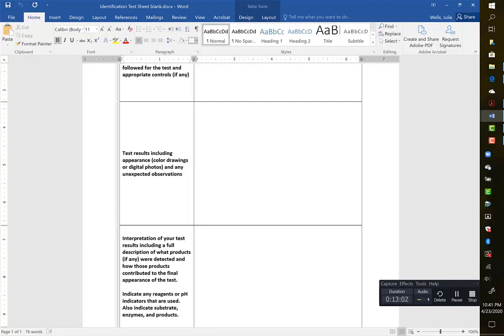So you can either draw it or you can insert that picture there directly. Now you might need to resize it because you might go to insert this streak plate and it might end up being huge. The file's large so that you could see the details. Just resize it down to size. If you need to, you can use this as a PDF. It doesn't matter how you decide to do it as long as you get a picture in this part of the identification sheet.